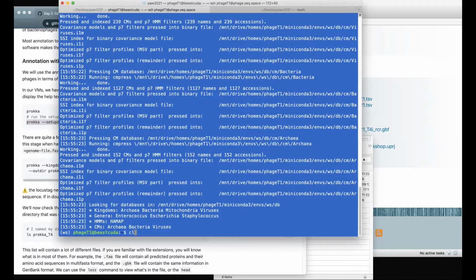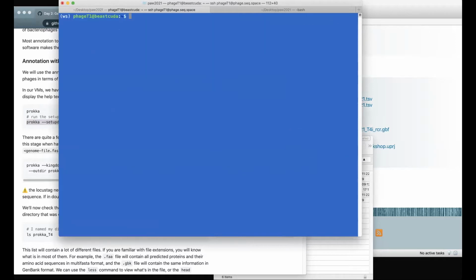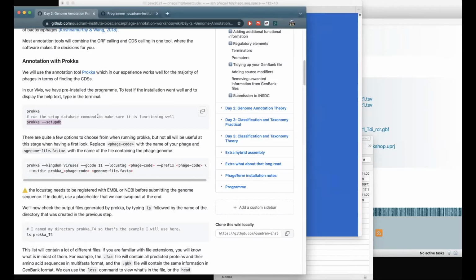Can I ask quickly, Evelyn? Yes. If you're looking at, for example, prophages, is it a good idea to go straight to the kingdom of viruses because there's far more data available in the bacterial genomes?